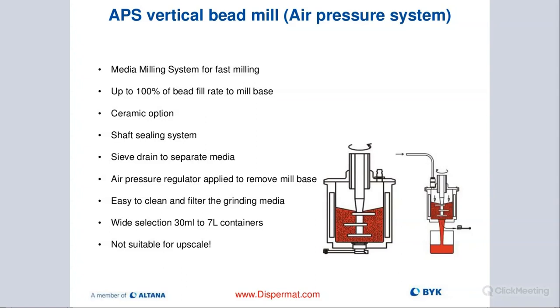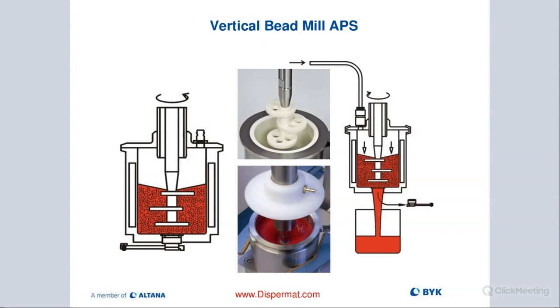I can go up to about 7 liters depending on my vessel size and dispersion model, but this is not really scalable up to production because how would you ever be able to manage a 2,000 liter production run, or container size? You would add a ton of beads, literally 1 ton. That's almost impossible to manage. So this is great for the lab space. Quick check, quick small sample production. Really, really good, but again, not scalable. Just a bigger slide, same thing we just talked about. So here you can see that cover with that air socket right there.